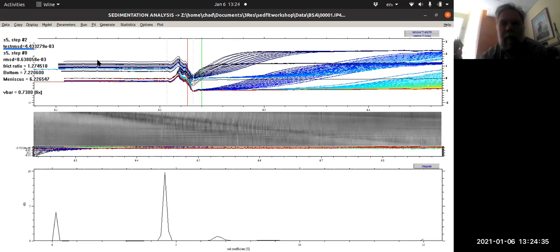Like I said again, if you get bored, you can just smash the spacebar and it will stop the fit. It will recalculate as much as it knows, and eventually it should give me a fit. So you'll notice we're fitting and refitting the data a bunch of ways.